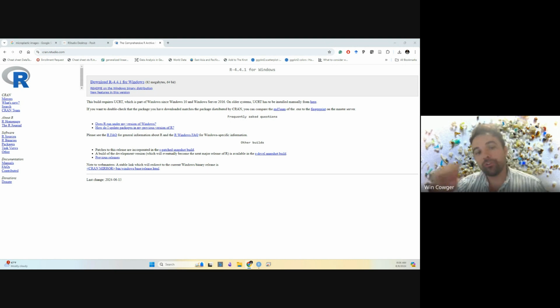Today we're going to be focused on batch spectroscopy, which is usually around hundreds of spectra to maybe 1,000 spectra. When you're dealing with even larger sets of spectra, you're usually dealing with spectral maps. In future tutorials, we're going to start working with spectral maps.